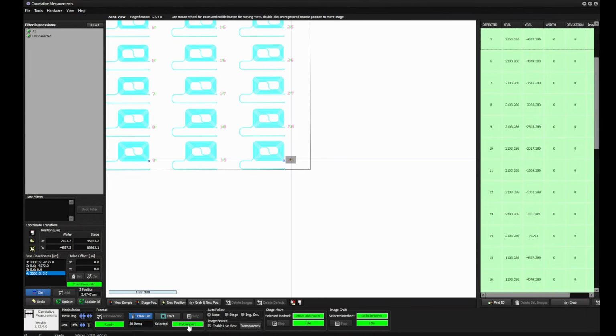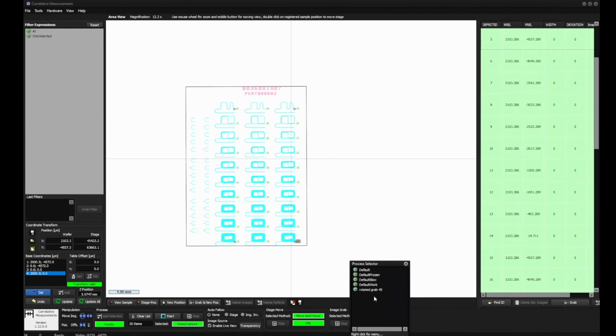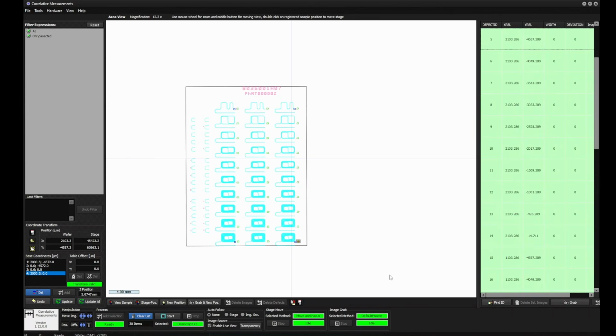We can select this recipe, demo capture, and this should now go to all places and capture, and then we can set up which scan rate, 7. We can take scan rate 6 maybe or so. Yeah, this is a capture recipe, and when I press start, then it starts doing it.